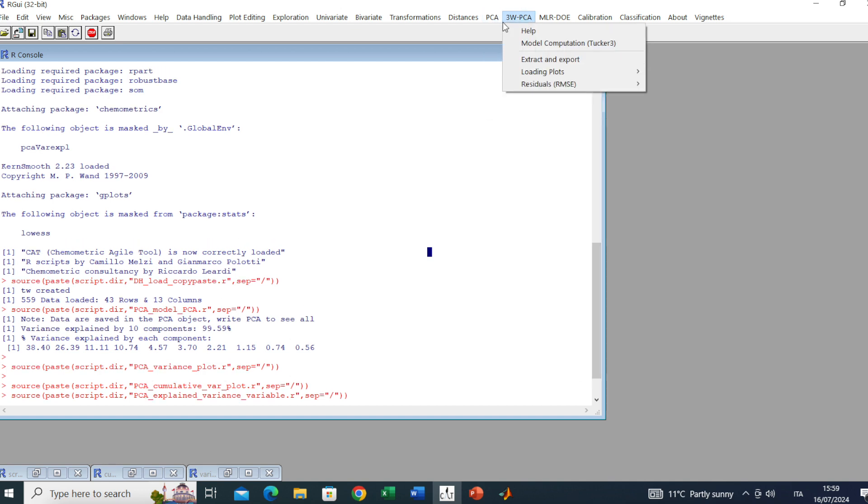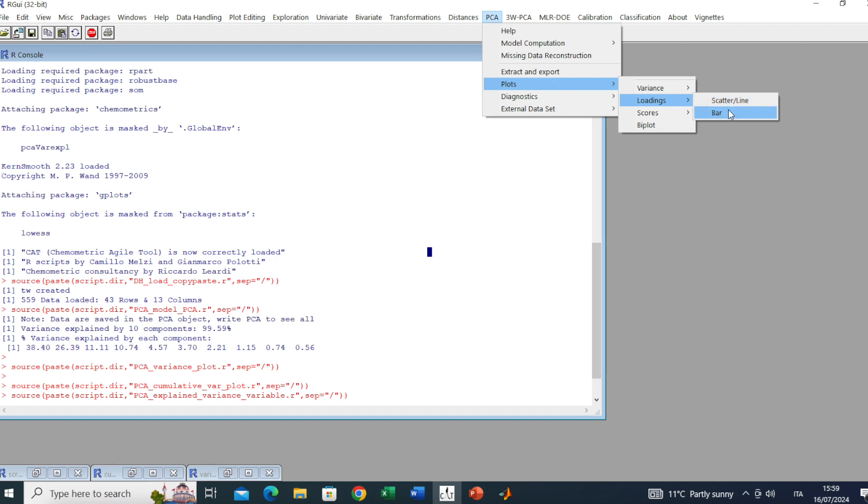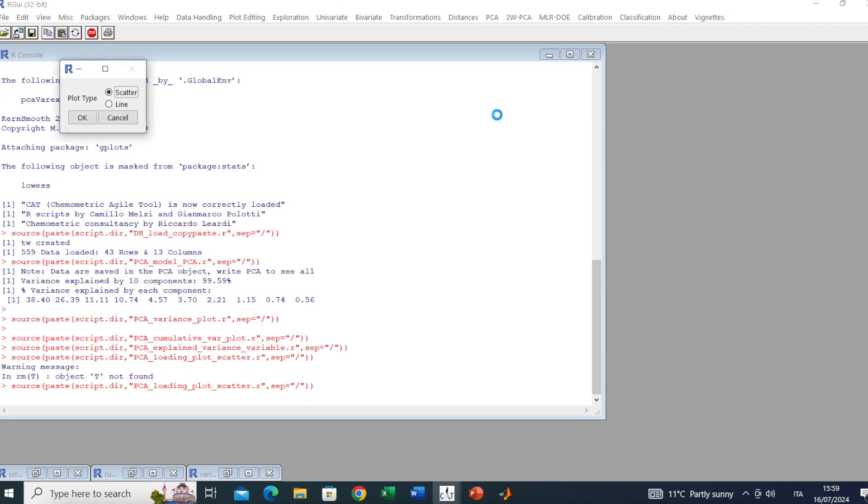Minimize all the plots and let's look at the loading plot, important to interpret the correlation structure within the data. We can produce the loadings in several ways as scatter, or line, or bar. The line plot is useful for continuous variables, for instance wavelengths of spectra.